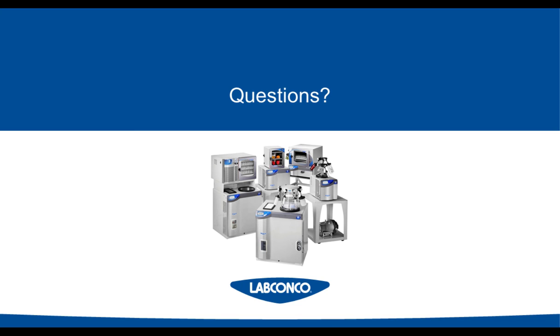Okay. Yeah, so it really just depends on what your end goal is. If you're trying to prepare something for long-term storage, or you're working with things like pharmaceutical research, a lot of people want to stopper under vacuum, and so they'll use either glass vials or ampule pods that they can flame seal under a vacuum.